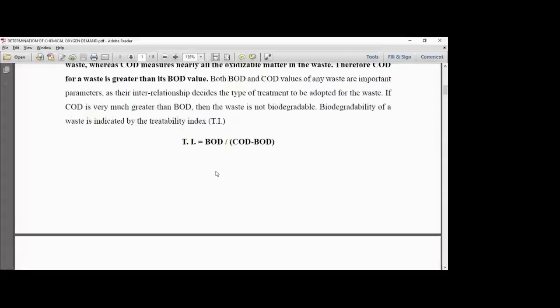So normally the examiner in the oral will ask you: I have a sample A and I have a sample B. He'll be telling you only this, that I am having a bottle A and a bottle B, and I have to decide which treatment is to be given. He won't be telling you anything except this. There is a certain sample, I don't know what sample it is. I've got that particular sample from somewhere, and these bottles are there; now tell me which treatment is to be given.